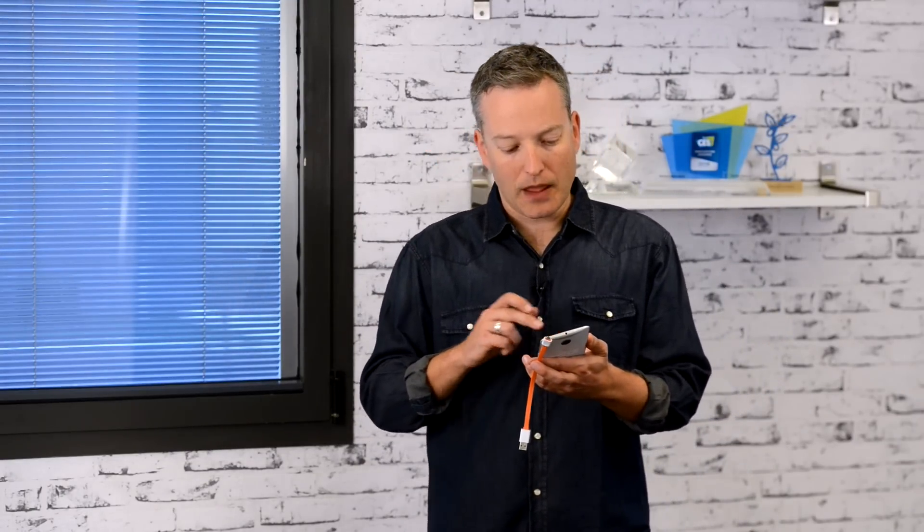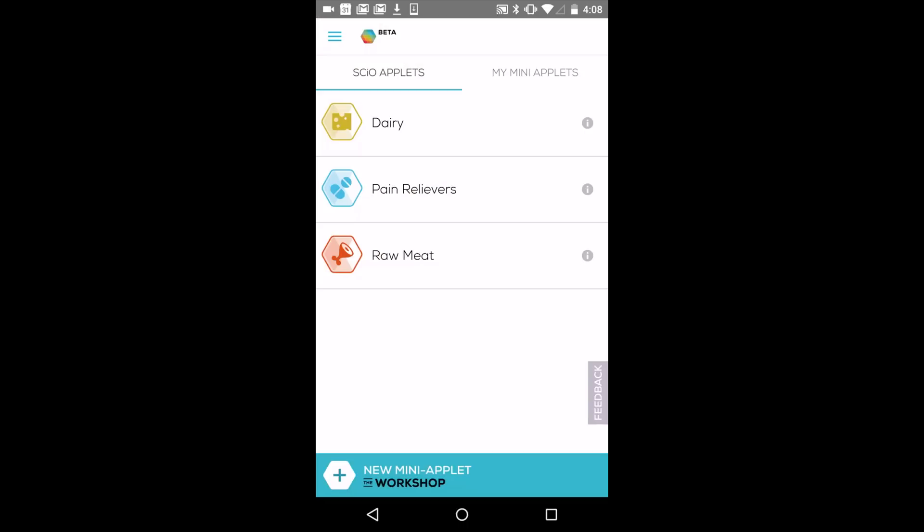Now that your SCiO is paired with your phone, let's take a look at the home screen. The home page includes the full-scale molecular sensing applets that we already developed for you, and more applets are added periodically. From the home screen, you can also develop your own molecular sensing mini applets to identify objects of your choice, like two different white powders. More about the SCiO applets and mini applets in a separate video.